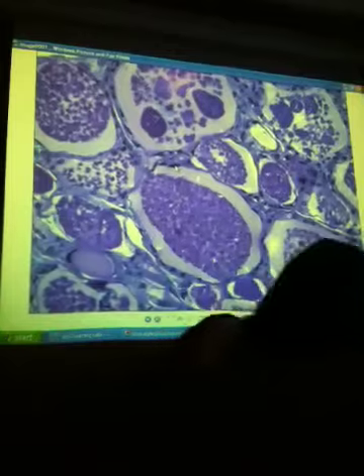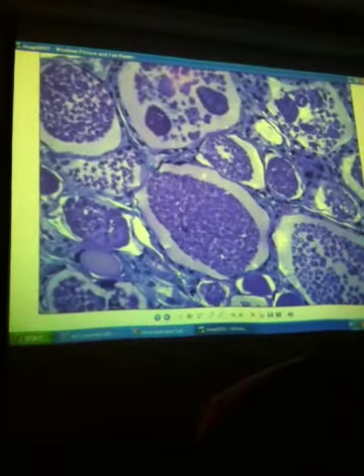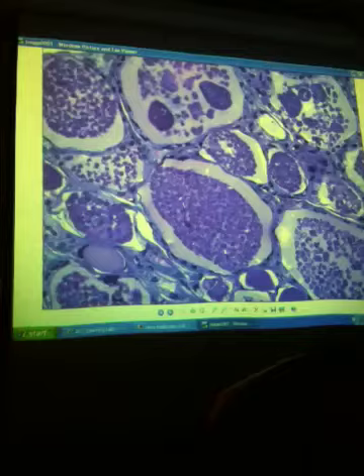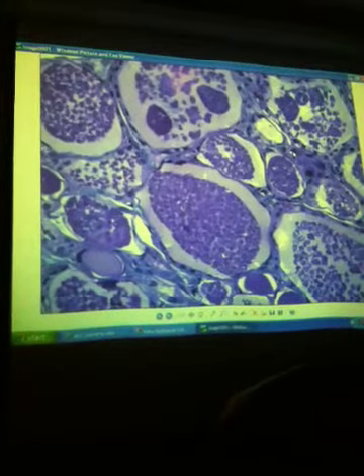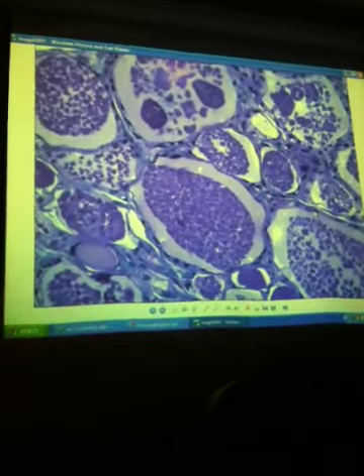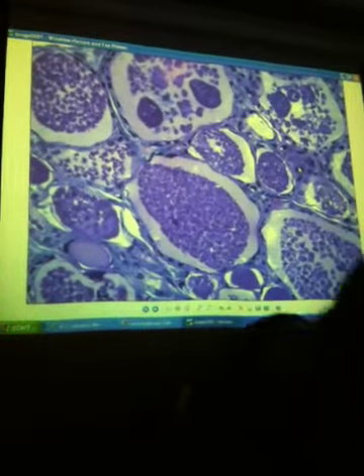So the edge, or between the follicular cells, what did you say? This is follicular, all around the edge. So this is a follicular. That's a follicular. Okay, that's another one. Anything that's way over here, like this, or like this, or like that, or this huge one up here, those are all parafollicular. And I'm going to try really hard to choose one that's really close, obviously forming the ring, or one that's really far away, not one that could be either.